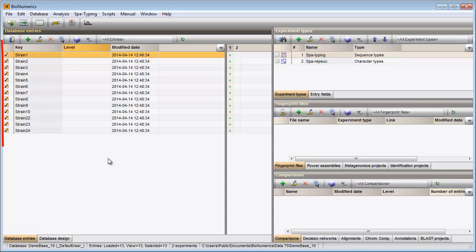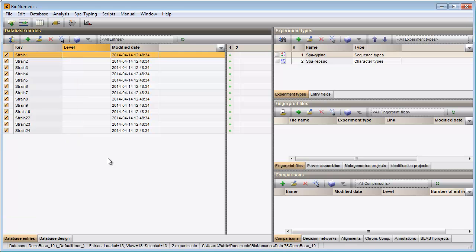The entries are displayed in the database entries panel and are automatically selected. For each experiment defined in the database, there is a column present in the Experiment Presence panel. A colored dot is displayed if a sequence is present for an entry-experiment combination.